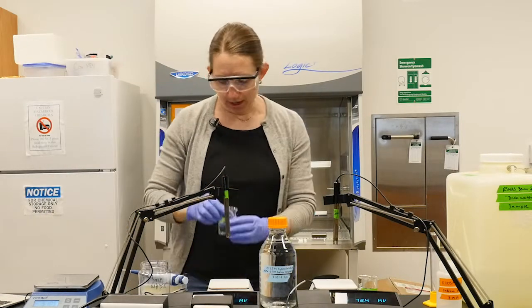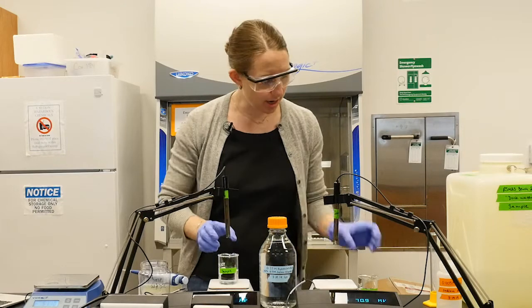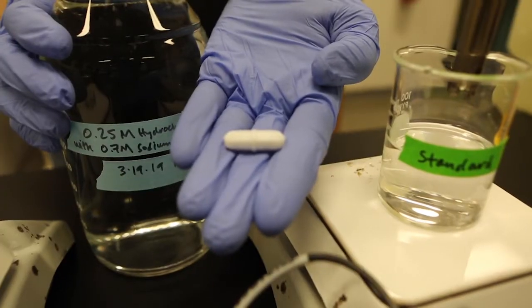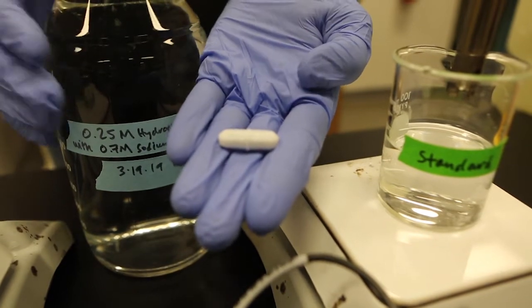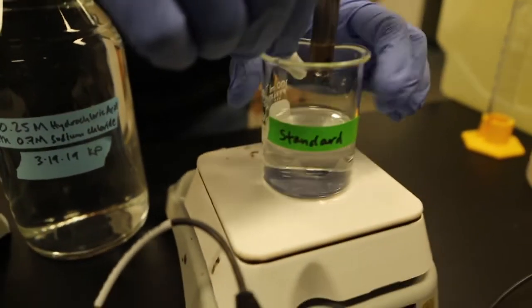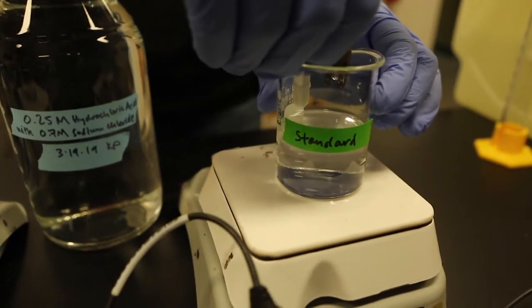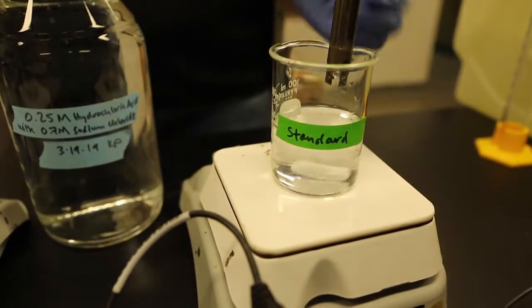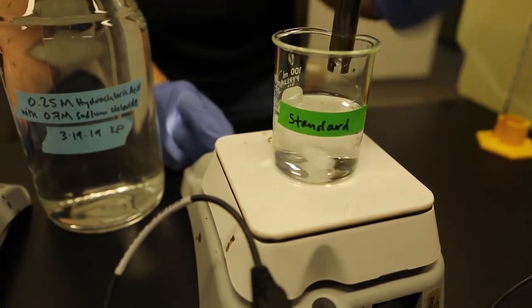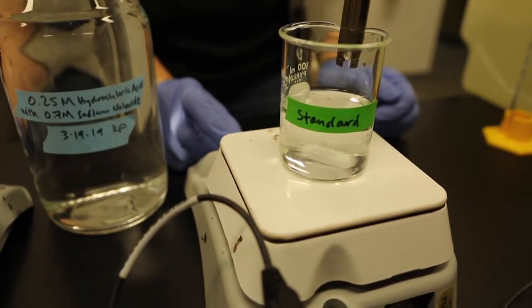Now we're ready to put our sample over here and our standard over here. So these are magnetic stir plates. We're going to drop in our magnetic stir bars to be able to mix our sample and get that acid addition fully mixed in. So we'll just carefully drop that into our sample. And we've got our stir plate on, and we have it at sort of a medium speed. We want it to be mixing thoroughly but not too fast.